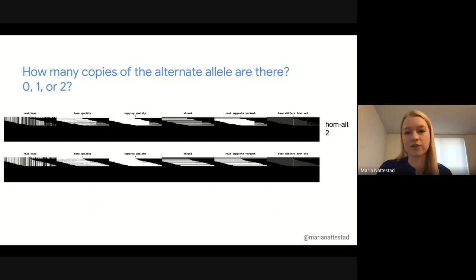This one, however, you have half of the reads supporting the variant in that fifth channel. We still see no base or mapping quality issues or anything else that would give me a warning sign here. So I'm going to say that this is heterozygous, which means that there's one of the two copies supporting the alternate allele that we're proposing at this location.